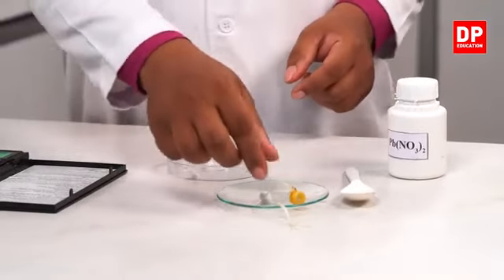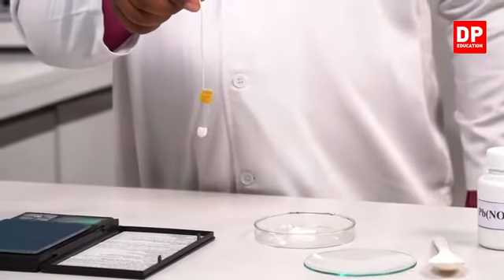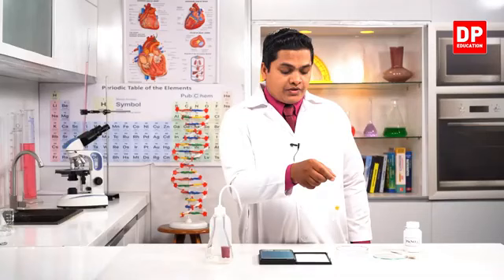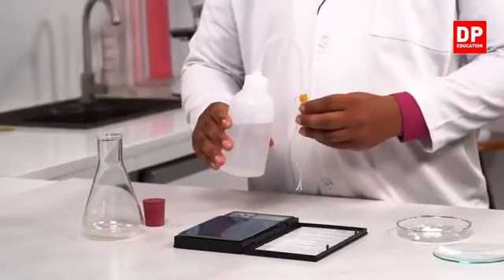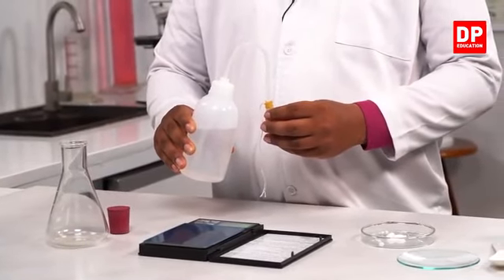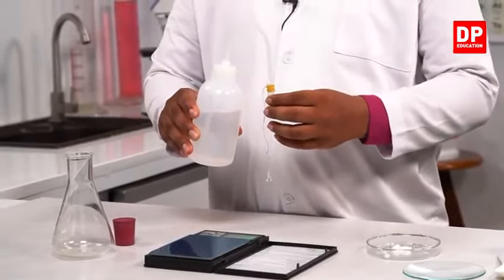And this is in the ignition tube. Here you can observe sodium chloride in the ignition tube. So now what I'm going to do is, first of all, add some water using this wash bottle and make a solution of sodium chloride.